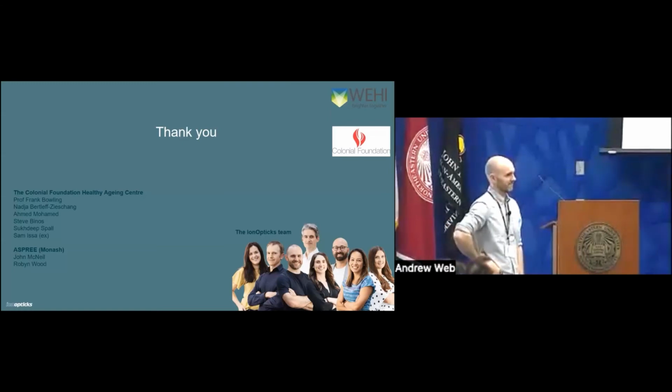Thank you, Andrew. Nikolai Slavov is asking the question. I really liked your optimism about the potential to further increase the sensitivity and improve the separation. If I ask you to speculate, would you expect to have significant improvements in sensitivity by improving liquid chromatography within the next 2-3 years? What's your view in terms of the time frame over which we are going to see those improvements?